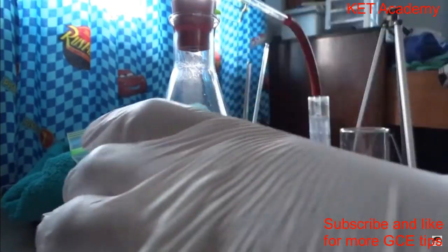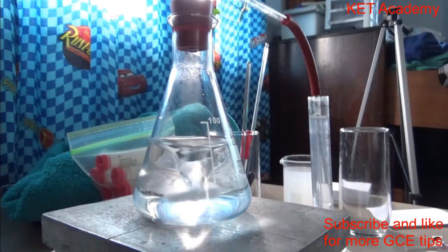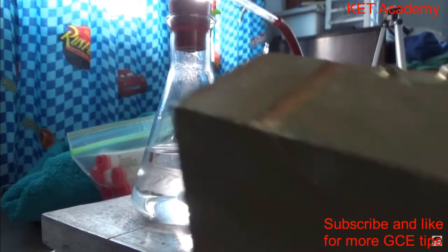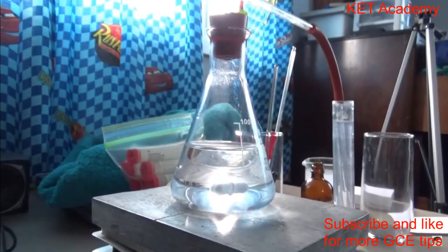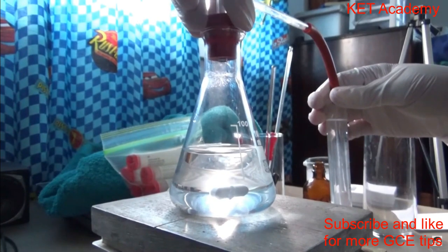Now, I am working with sulfuric acid here, so I'm going to have to be very careful. Oh, I don't want to tip this over. I should use a better base than that, shouldn't I? These gloves probably wouldn't work that well for that. You know what? I'm going to be smart, and I'm going to replace this very unstable mortar with this little piece of wood here. That should be way more stable. Okay. Now back to what we were doing. It's always better to be safe than sorry when doing chemistry, especially when working with strong acids.